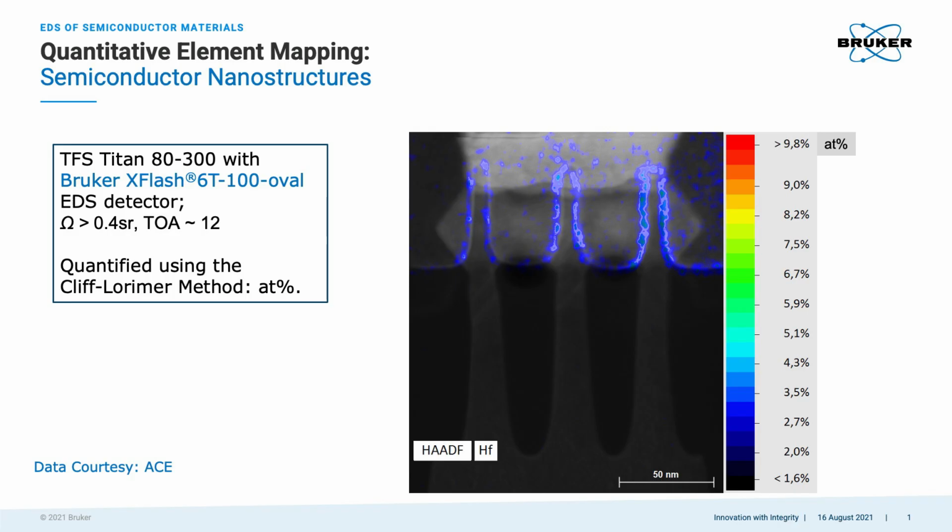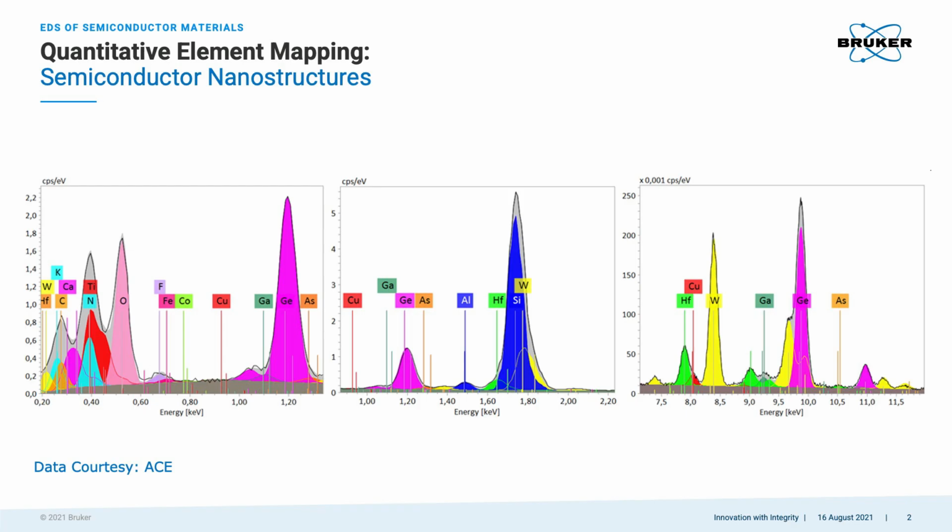That is a more simple deconvolution technique, doing just several iterations to be fast, and one can check on the fly how the tungsten and silicon and hafnium, for instance, can be separated. Some overlaps need more iterations and a proper quantification step. But once the quantification procedure is set up, it's just push a button, and then the quantification runs for a minute or a few minutes, and the elements are really well separated.